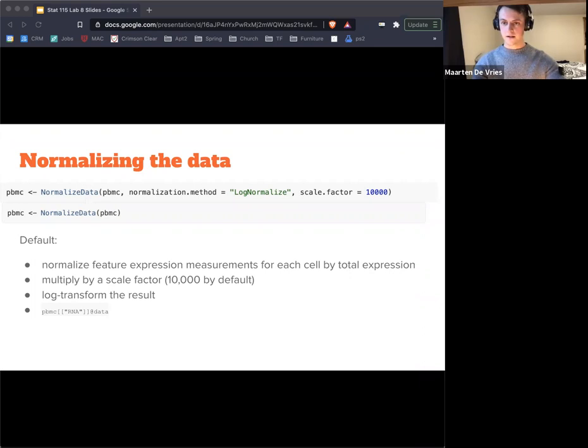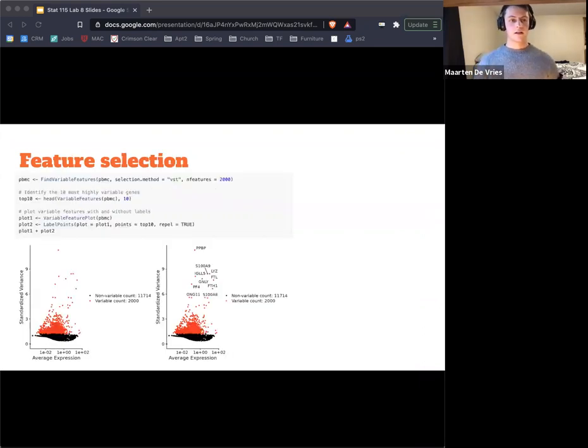All right. Then what they've found is that focusing on a certain subset of genes in downstream analysis helps to highlight signal from the noise. There might be a lot of genes that just don't vary that much across cells. Maybe all cells use them or all cells don't really use them. Where the action is happening is with genes that have a high variance between all these different cells. That's where you can really glean some insights. So just taking a subset of those genes to your downstream analysis can be very useful, and it's also quite a little bit faster.